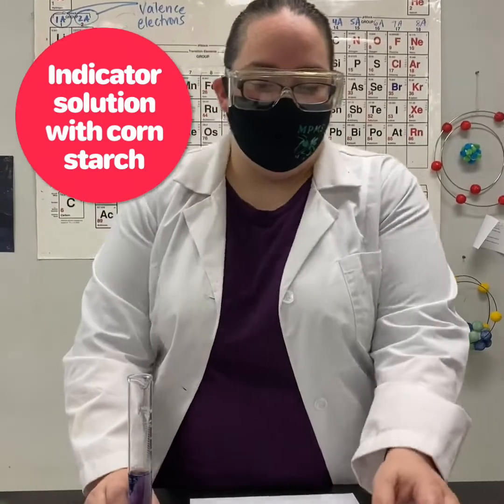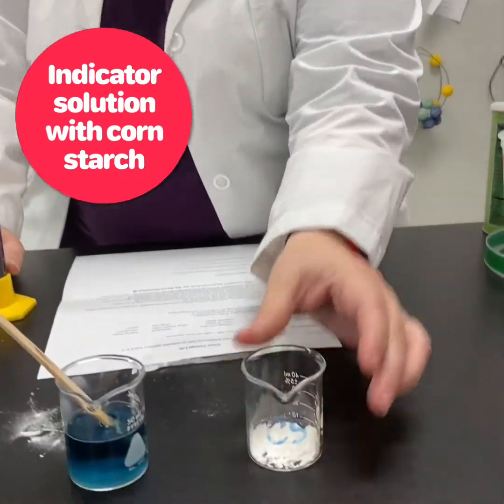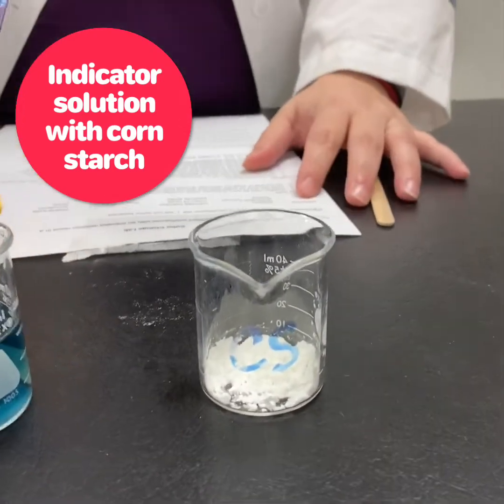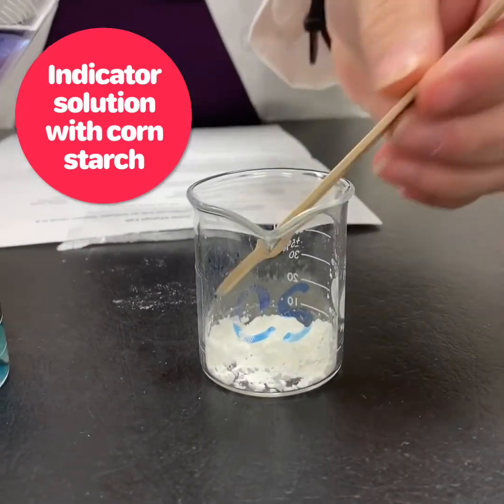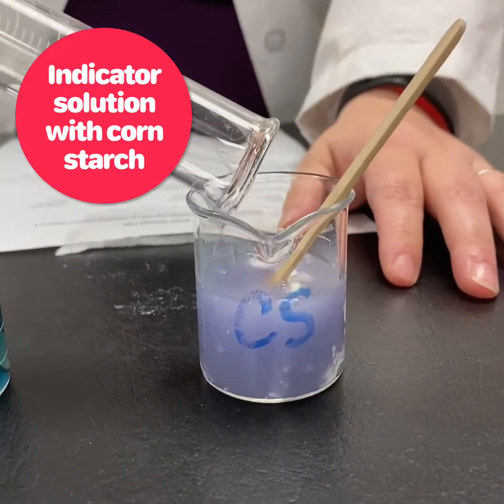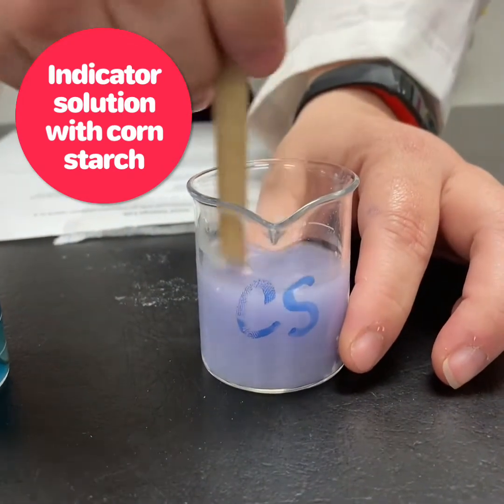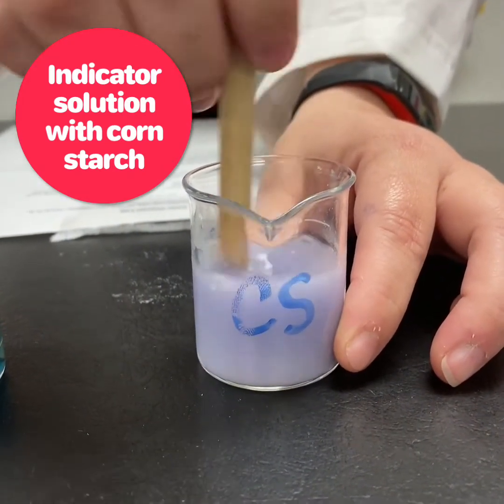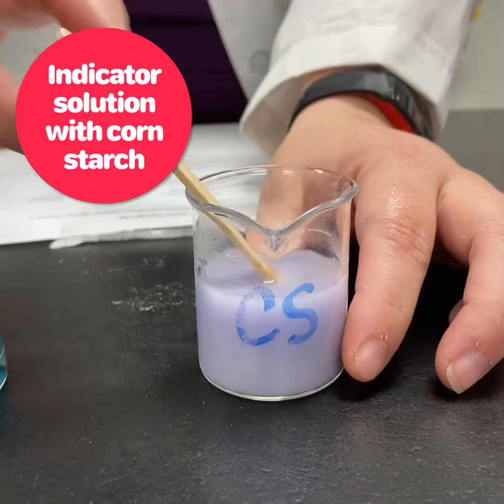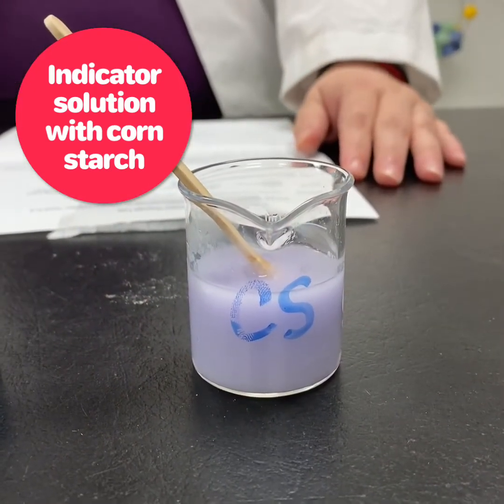Our last substance is our cornstarch. It's a white powder. We have our 30 milliliters of indicator solution, and we're going to pour it in. You'll notice that it has turned a pale purple, light purple color.